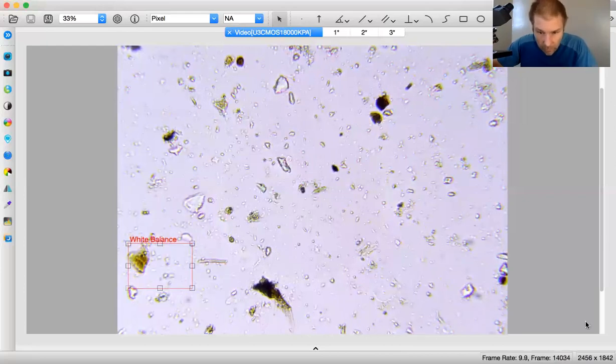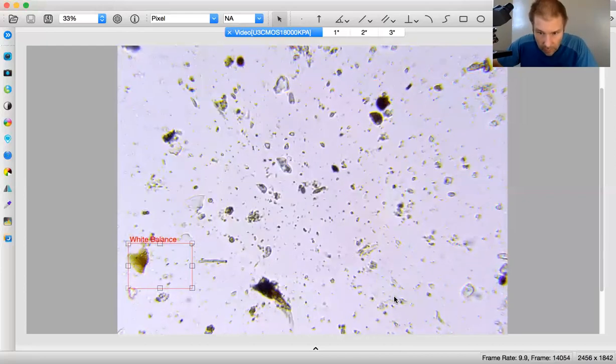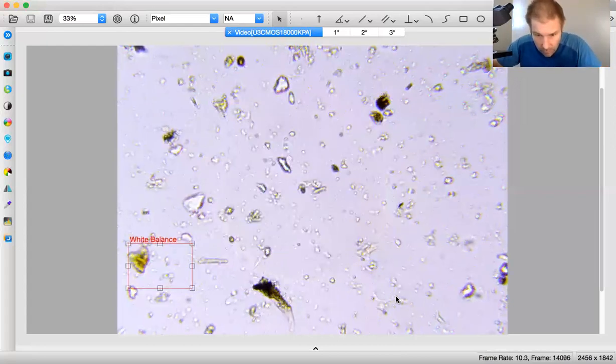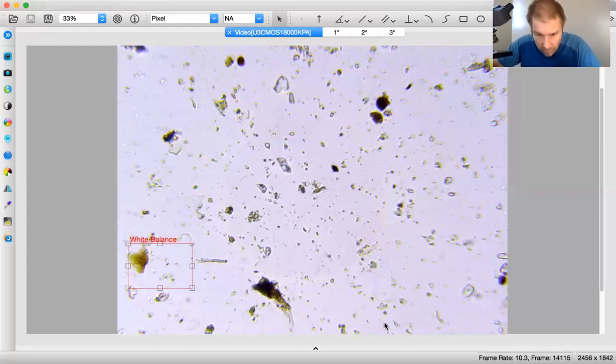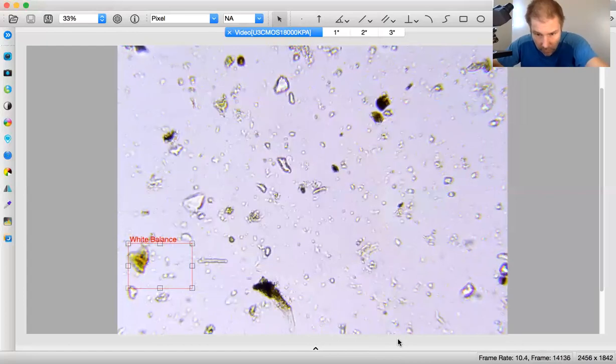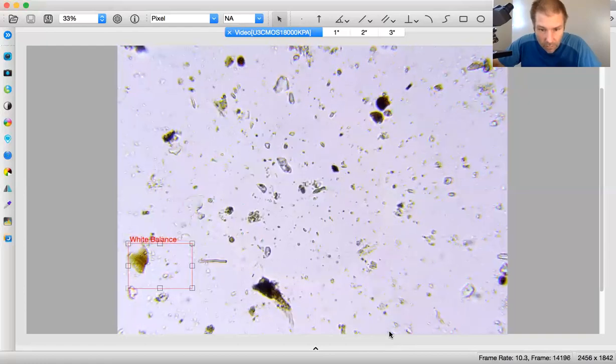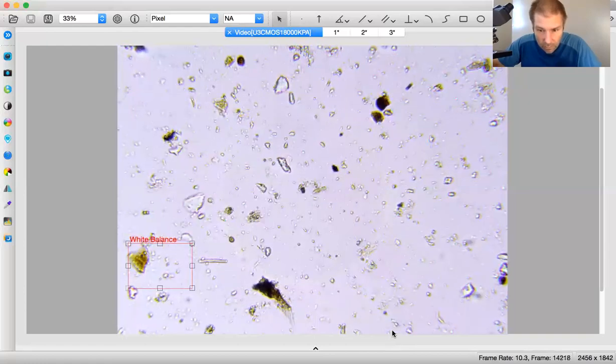I see more actino right here. That'll be a 0.1. There's more right here. And that's a 0.05 rather. So we got 1.5.